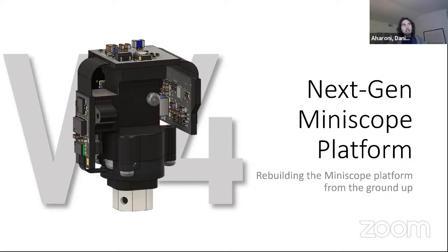The only other thing I'll say is that it used to be the case, especially for deeper structures, that some people thought the most optimal approach, to give you the highest chance of seeing cells, was to do a GCaMP injection and wait until those cells are able to fluoresce. Then when you implant a long thin GRIN lens, you image through the lens as you implant it, move down until you start to see fluorescence, and that's where you stop and cement everything in place.